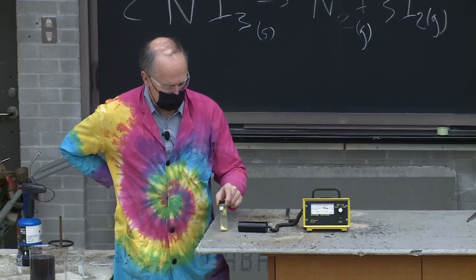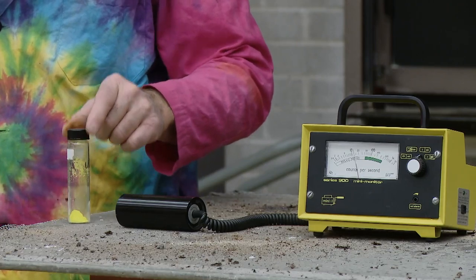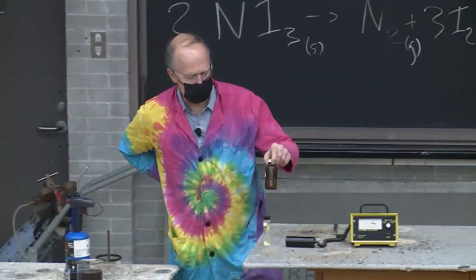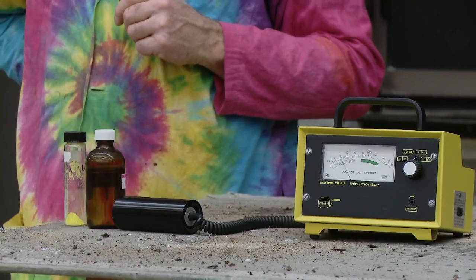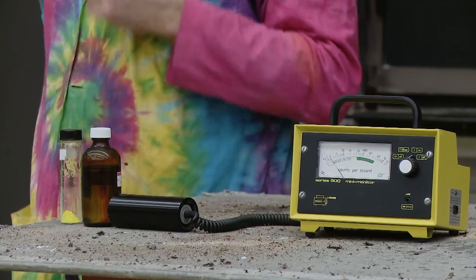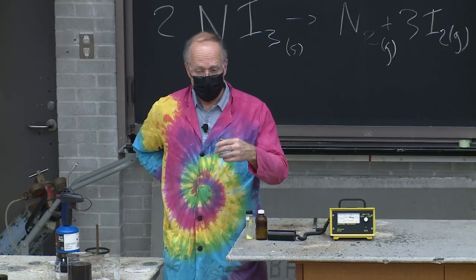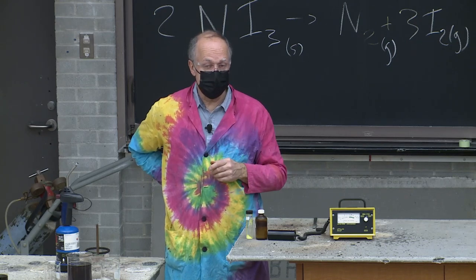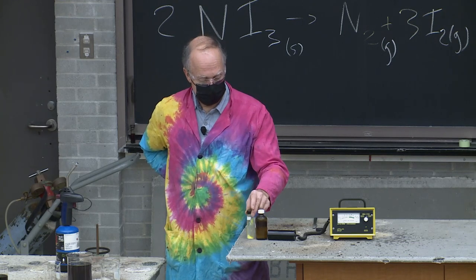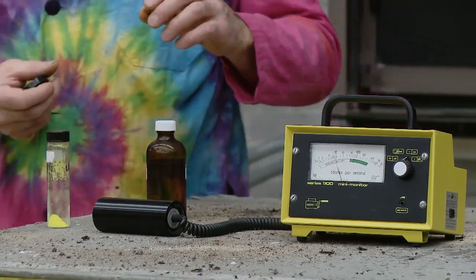You can understand this detector as representing yourself, with the radiation getting into you. One way to protect yourself is just to move away — the amount of radiation goes down as the square of the distance between you and the source. Another way is to put some mass between you and the source. I've got a bottle of water here, and if I put that between the source and the detector, the radiation virtually stops. That's what happens at the dentist when they put a lead apron on you.